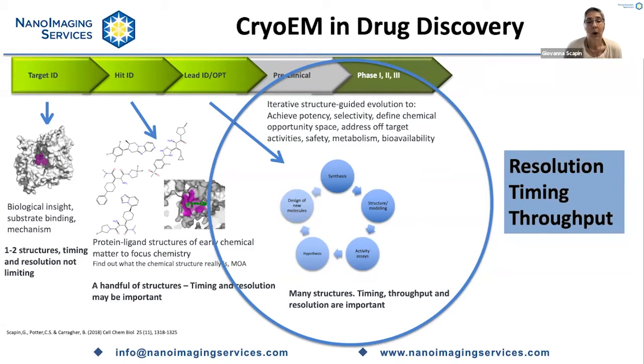What is required in this step of the drug development is the capability of providing structures at high resolution with a very high throughput and with good timing. The resolution I'm not even going to talk about, because we know how important it is. If we want to see atoms and ligands and bonds, we need to be at high resolutions, but we are moving there with cryoEM more and more often.